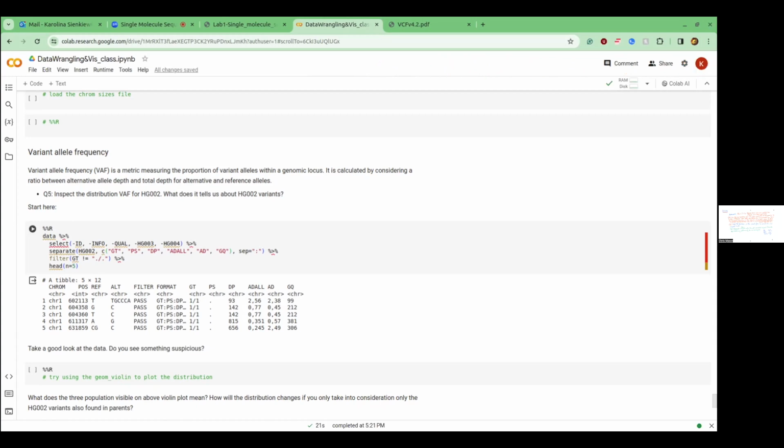Anybody know? Probably not. So I will just give a response, and this is something that I will link to if you are interested to take an additional look. Basically, what it means is that for AD, allelic depth, the only reads that are counted are informative, and a read can pass through the filter check but still be uninformative. It's all about the likelihood of alleles given the read, the likelihood of the allele actually being a variant.